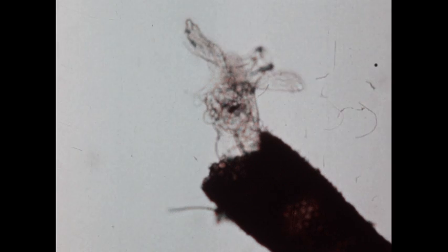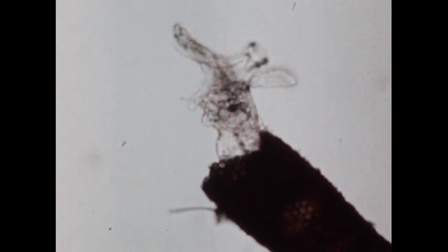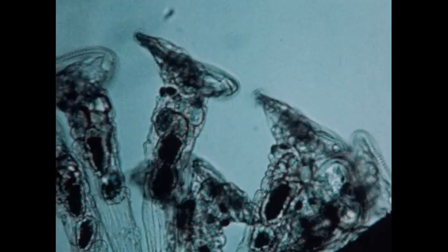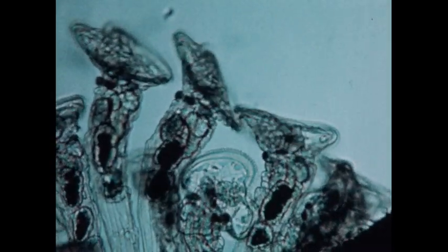Other species of rotifer are even more specialized. This type builds itself a protective tube by cementing together tiny bits of debris, while this species lives in colonies. The beautiful lobes with their moving cilia seem to revolve, giving us the name rotifer, which means wheel bearer.